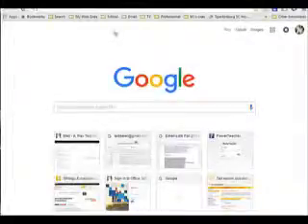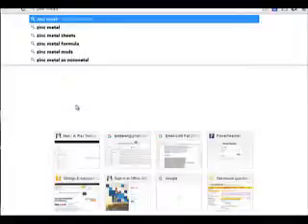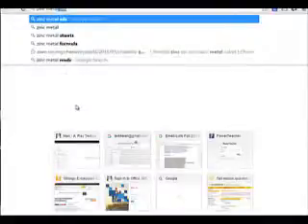All right, so let's type in, our first metal was zinc, and let's just call it zinc metal. Now, where you're going to find this stuff is in what is known as an SDS. SDS, you need to know what those letters stand for. It stands for safety data sheet.